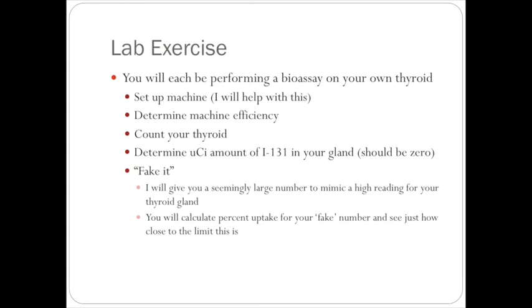I think you'll be surprised, even though sometimes you think, oh my gosh, that's such a big number. Remember, your single channel analyzer reads each individual photon interaction. So a big number, 500 counts, is still only 500 atoms that gave up their disintegration. And so that's really, in the big picture of how much activity or how many disintegrations happen in a microcurie, millicurie, curie, that's still a fairly small number, but we'll let you practice it just to kind of see.